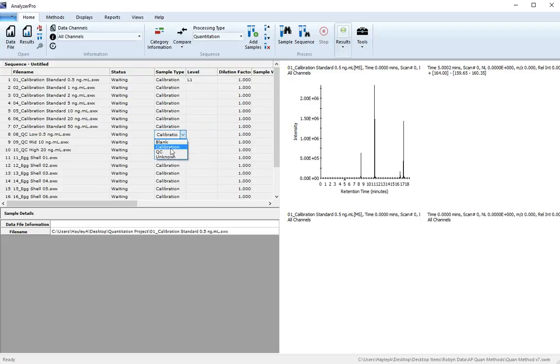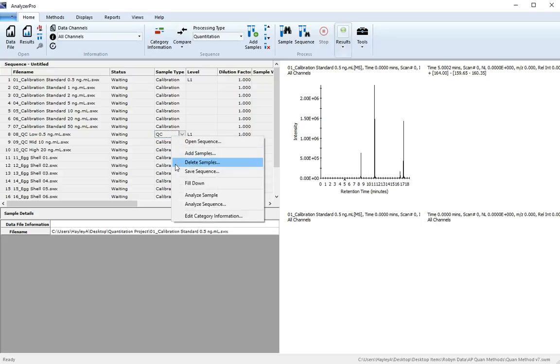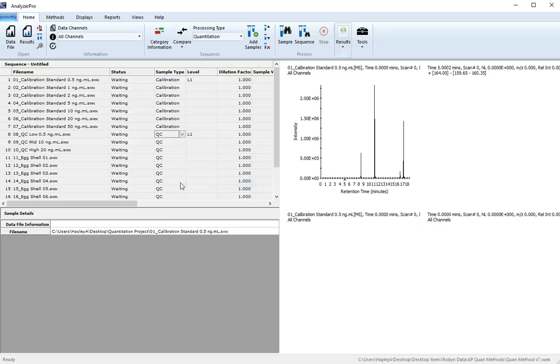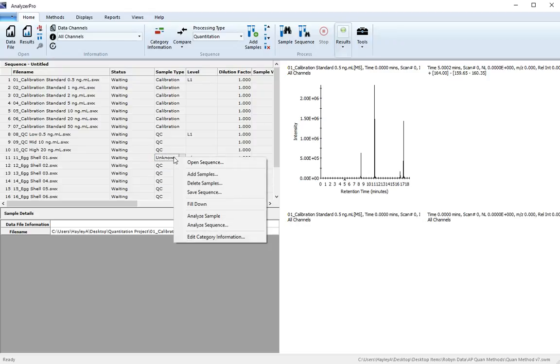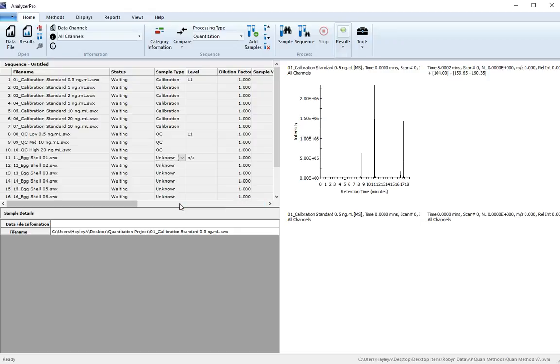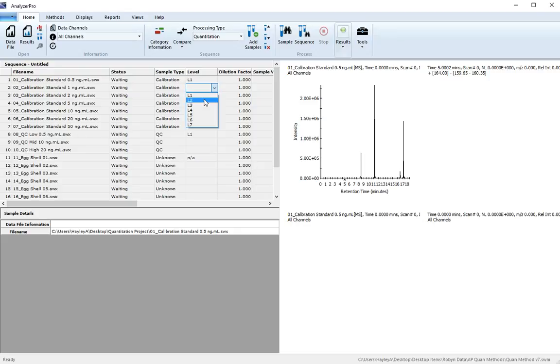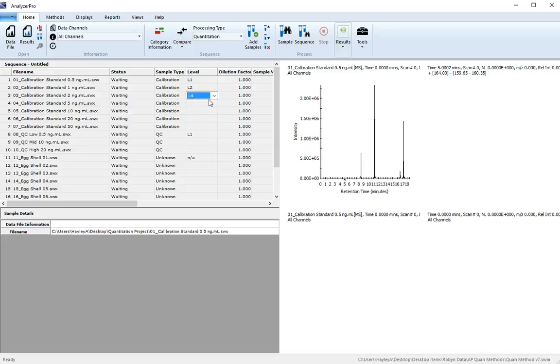Next, we have QC samples, and then we have our unknowns. From the data file name, you can see the level of each calibration standard. Fill out the appropriate levels in your sequence.